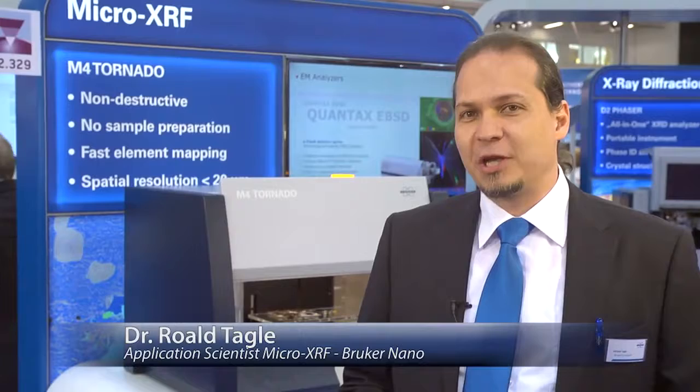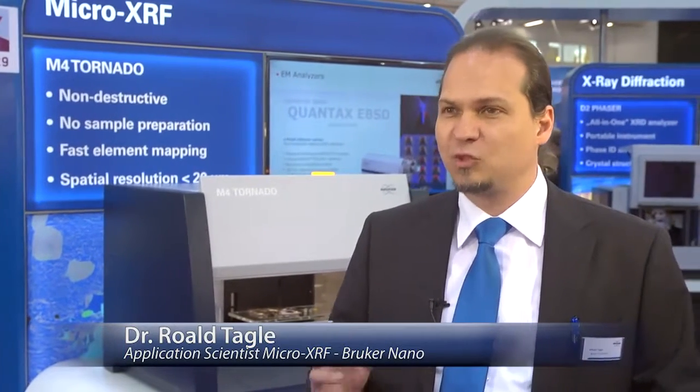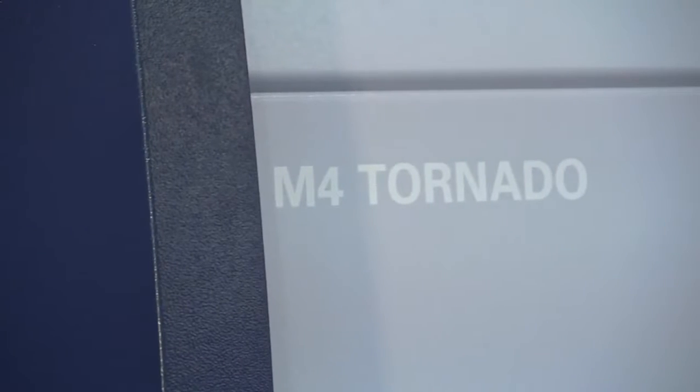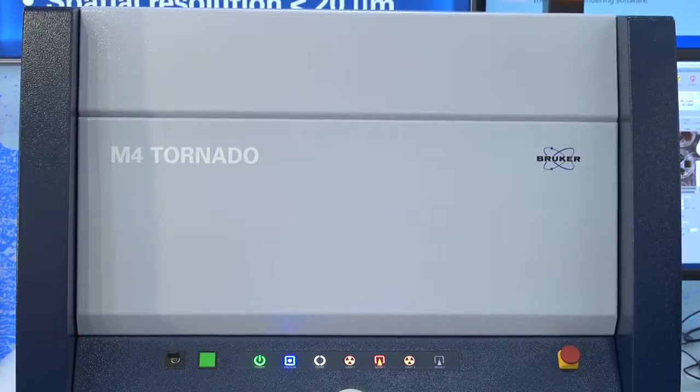The instrument that we are presenting today is called µ-XRF. If I just describe it in a few words, it is the possibility of getting X-ray fluorescence with spatial resolution. That means we are able to determine the two-dimensional distribution of elements on a sample. And the interesting thing is that there is no one special application, but a variety of applications and fields where you can use it.